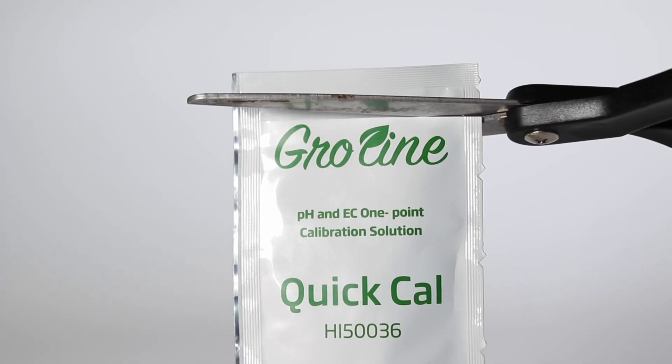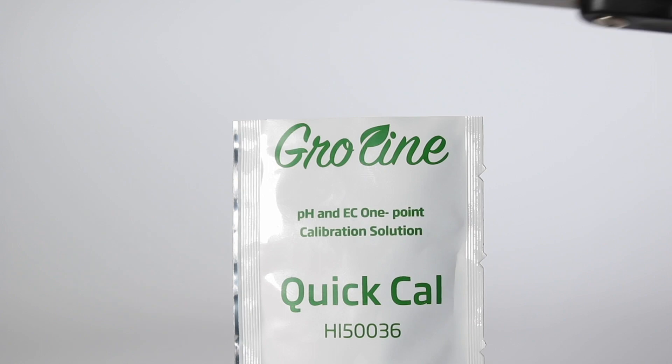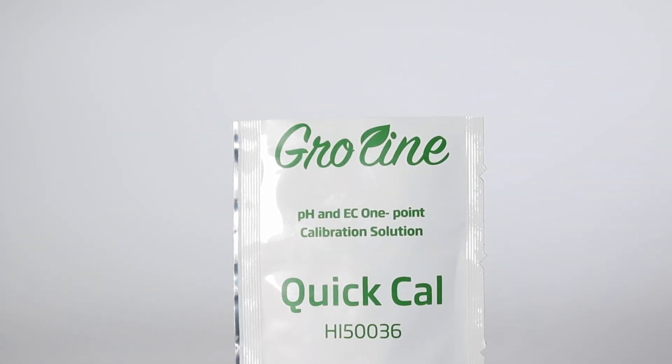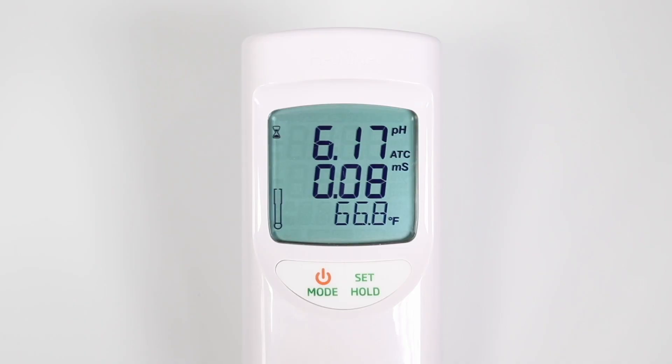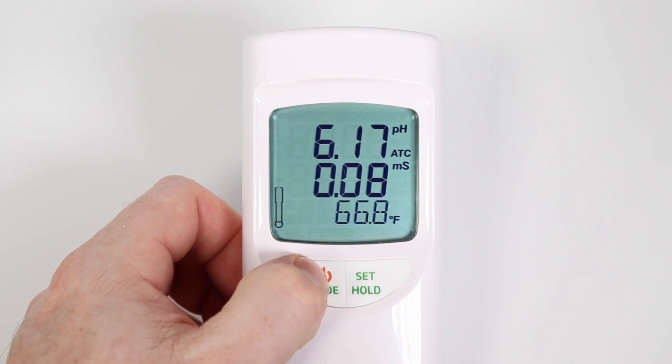Next, open a packet of quick cal or pour solution from your bottle of quick cal into a small container. Make sure there's enough to submerge the entire glass bulb. Press and hold the mode/power button until quick cal appears on the screen.